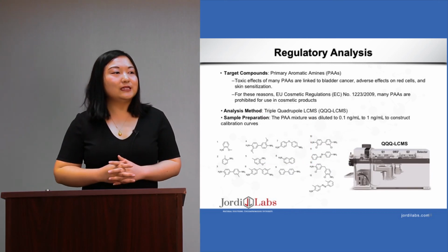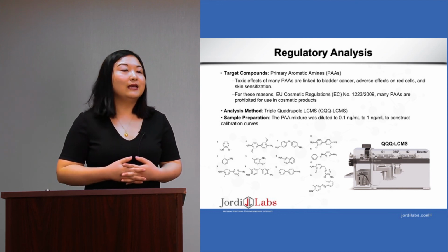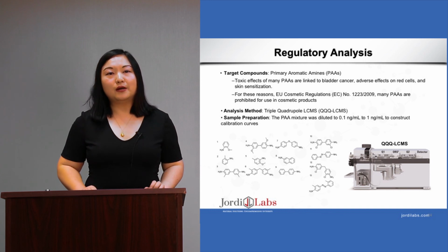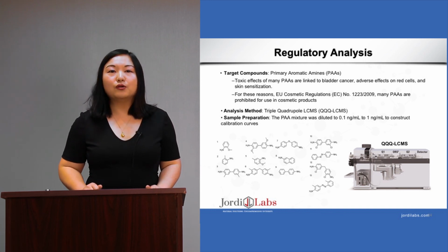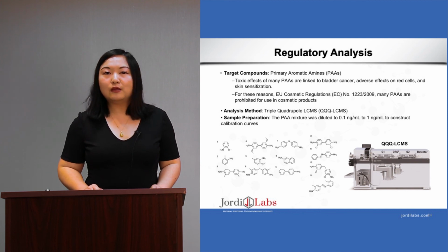Another thing we did is the analysis on PAA. Those are primary aromatic amines. PAAs are a group of compounds which again can cause cancer and can have some adverse effects on humans, even at a very low level.